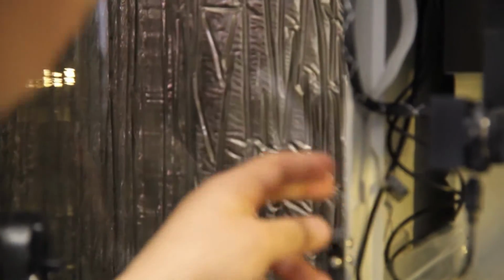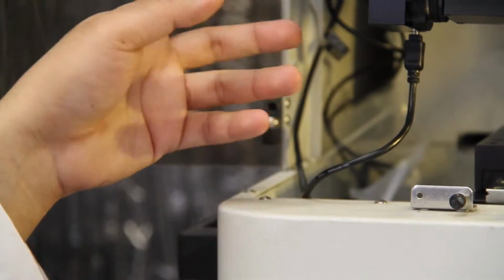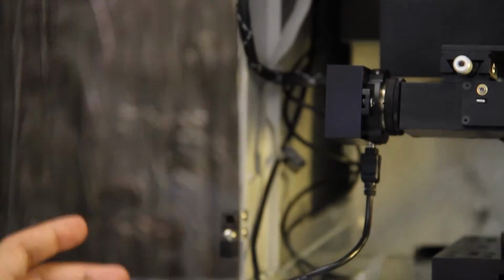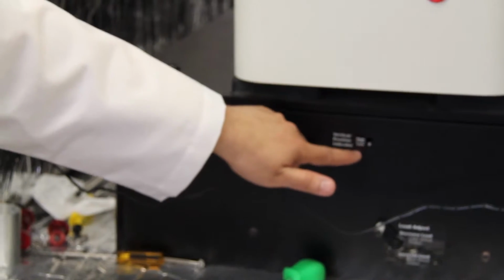Be careful when installing the nano head with the AFM camera and indenter. There are two wires you have to plug in. One goes on the side and one goes on the camera. That's a regular USB port. After that, you can unscrew the 4 screws from the table, so it should be floating. And make sure this vertical position indicator is on the middle line up here.